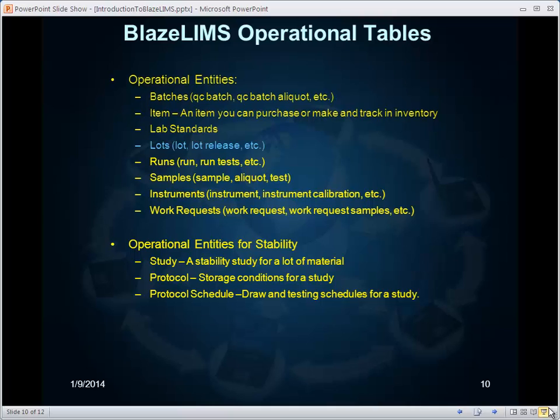Lots, used for lot tracking and lot release. Runs, which is an arbitrary collection of tests to be processed as a unit. Samples, including samples, aliquots, tests, sample containers, and so forth. Instruments, including instruments, their calibrations, and other records associated with managing them, such as usage. Work requests, a collection of samples with associated testing to be processed as a unit.